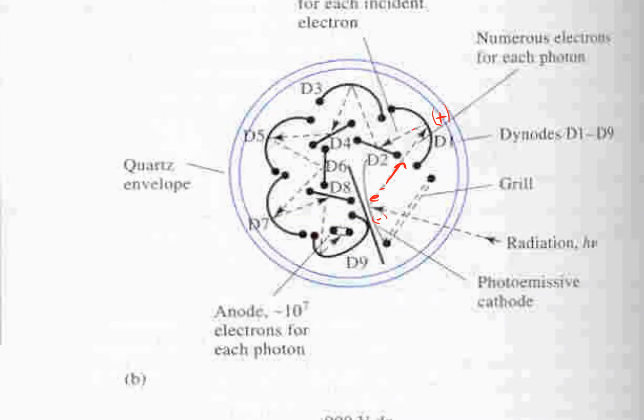And then if you want the electrons to go to dynode 2, well, gosh, you better make it more positive, right? And I'm using the number of positive signs here as an indicator of how positive each successive dynode is. But you get the idea. You got to make each successive dynode more and more and more positive.